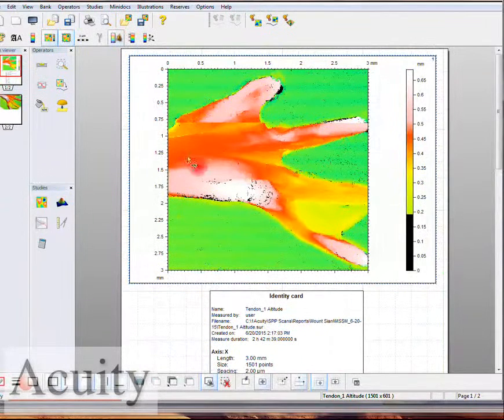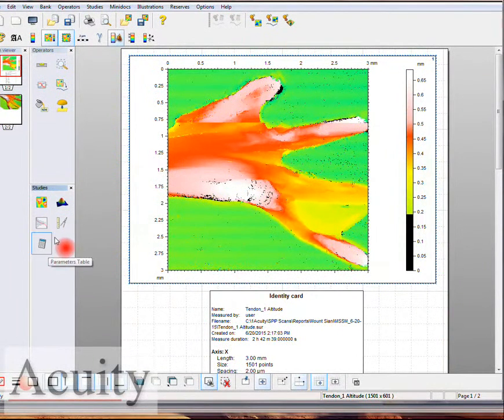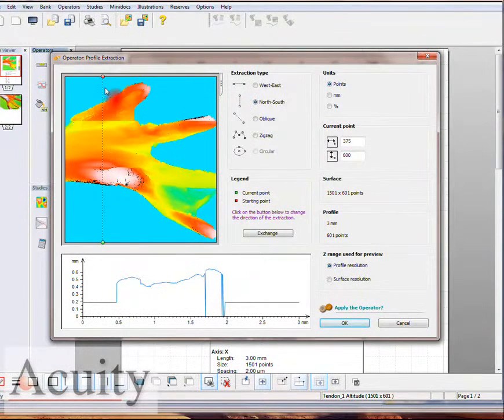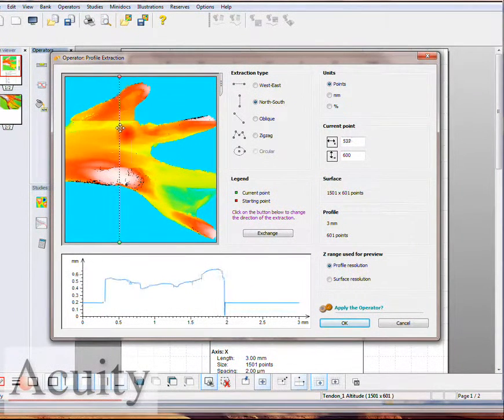Let's come back and look at the 2D measurements on this. Let's go ahead and do a profile across here.